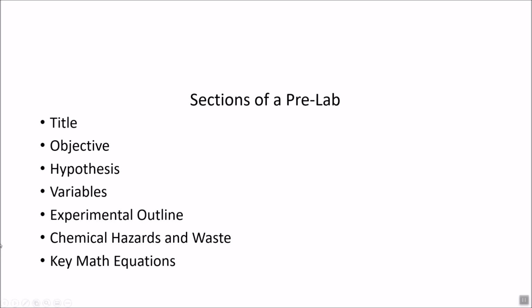So the title of this experiment could be something along the lines of determining the concentration of salt in an unknown seawater solution, or what is the concentration of salt in an unknown seawater solution, something like that. The objective is to determine the concentration of salt in the unknown seawater solution.